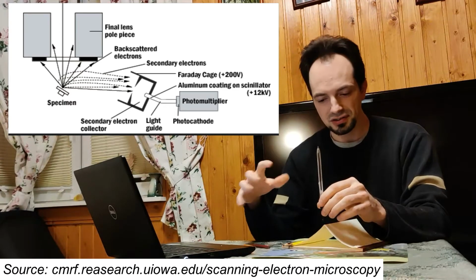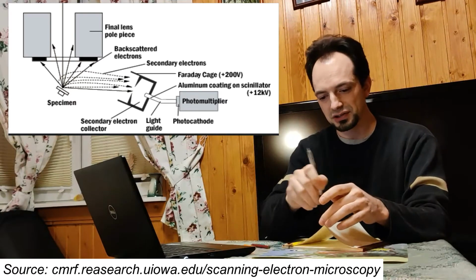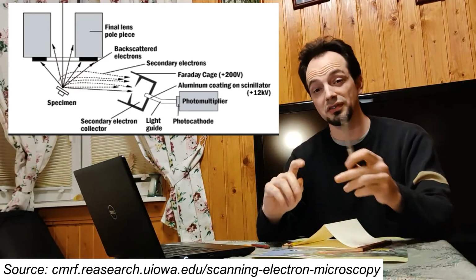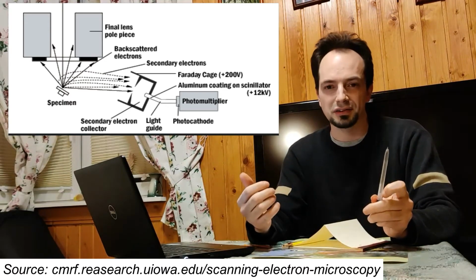the signal intensity changes because almost all secondary electrons now can reach the detector because they are all going in that direction. The detector is here, we catch almost all the secondary electrons and we obtain quite a high signal there. So when we start coloring the pixels on the right part of that top line, we are obtaining high signals here, and we are coloring the pixels white or light gray, if you will. And then we do the same for all the lines. And we end up with some kind of image that consists of pixels colored in all shades of gray.